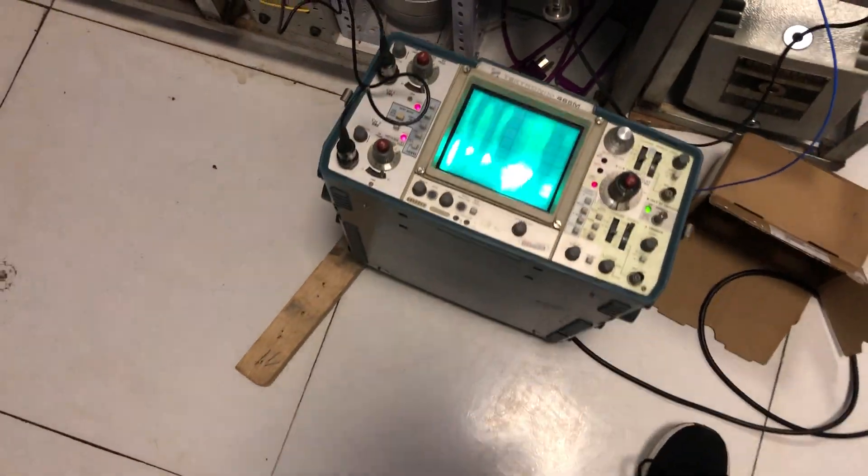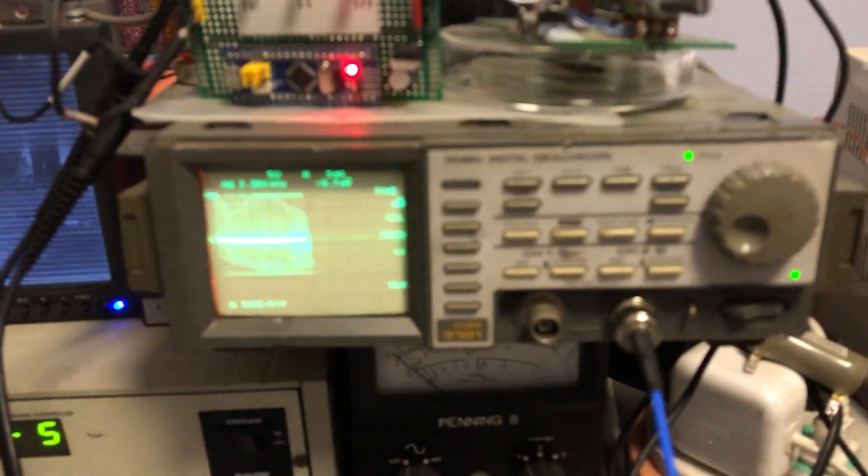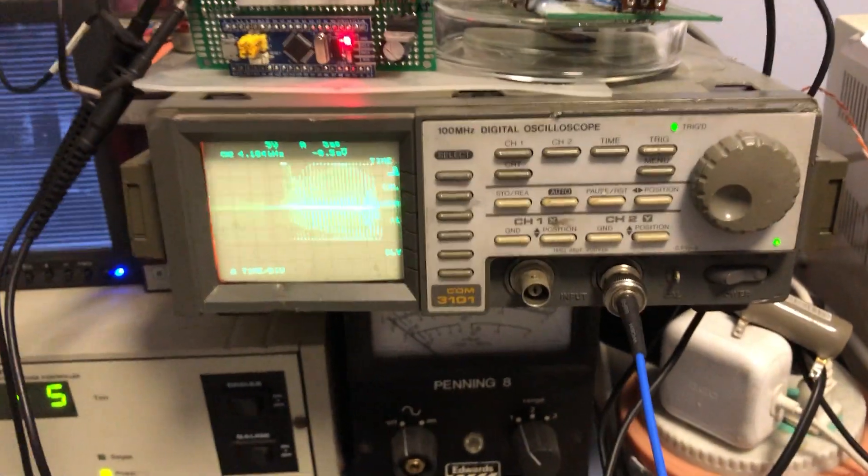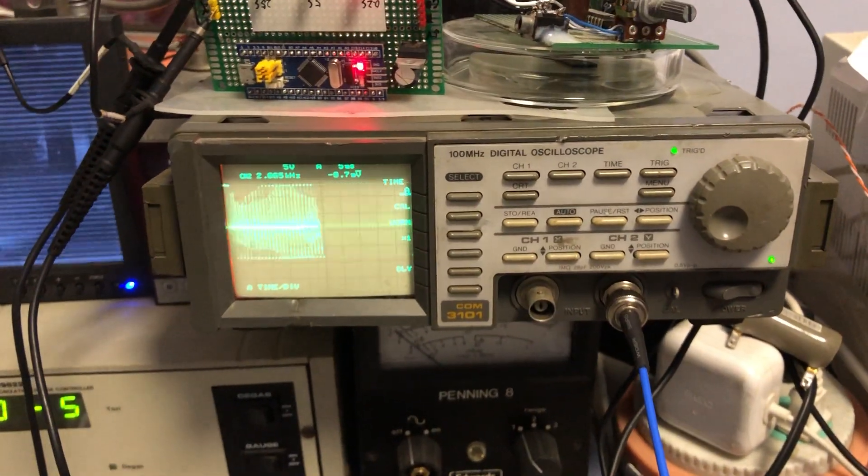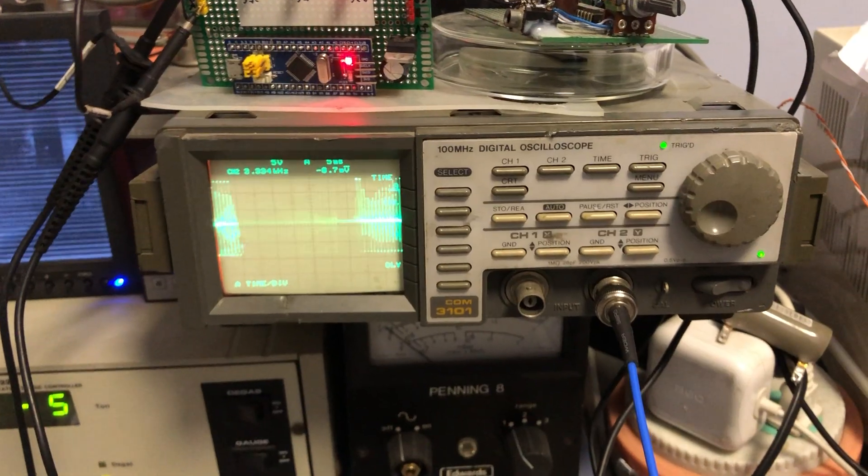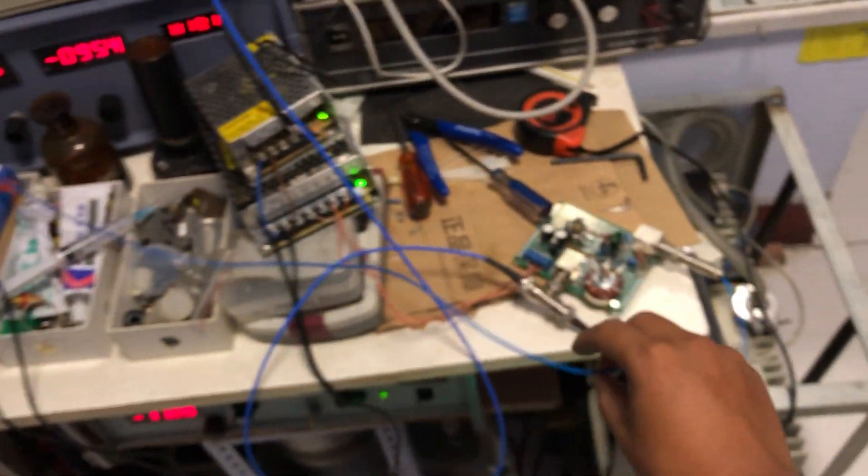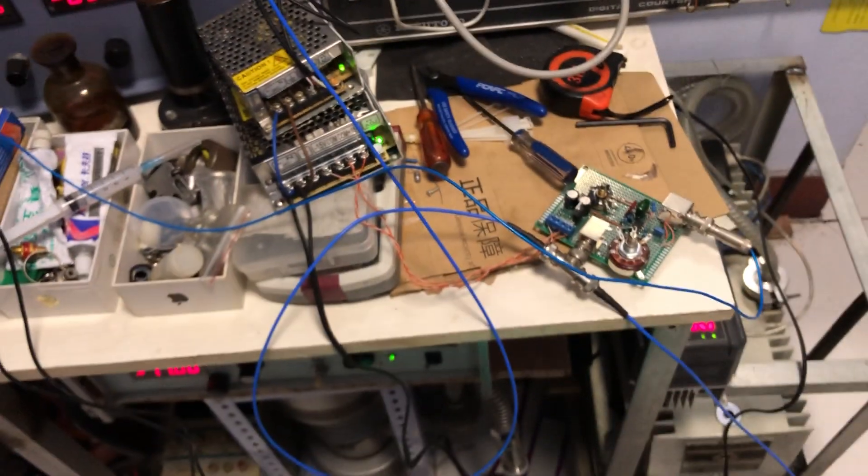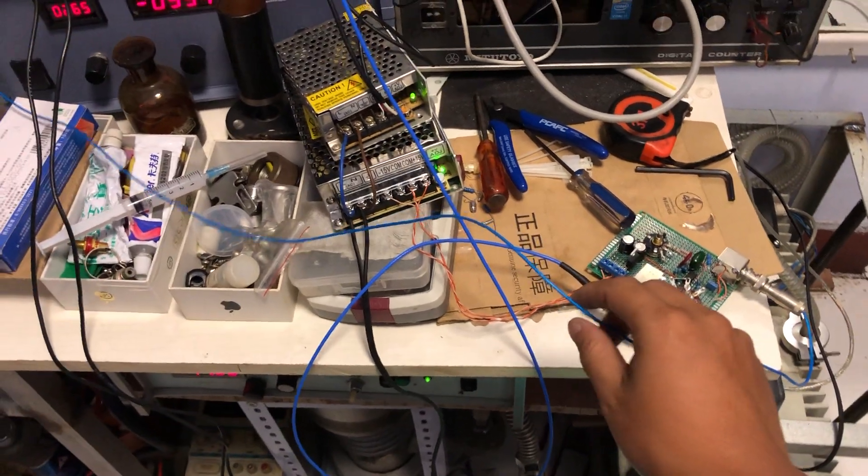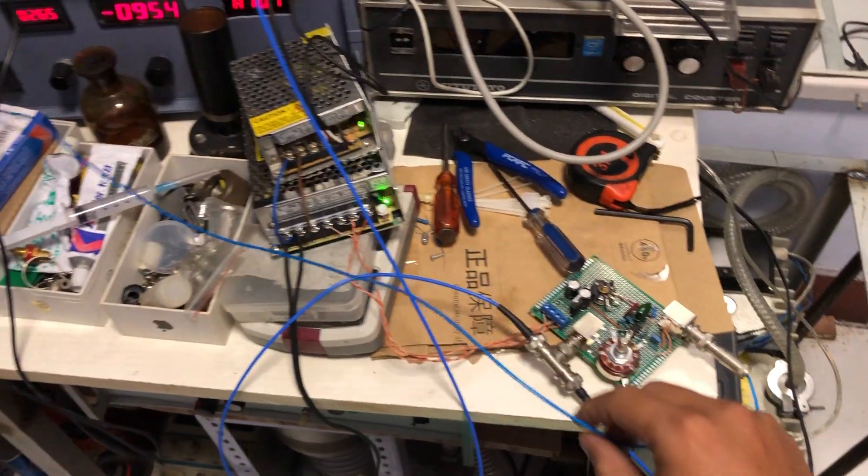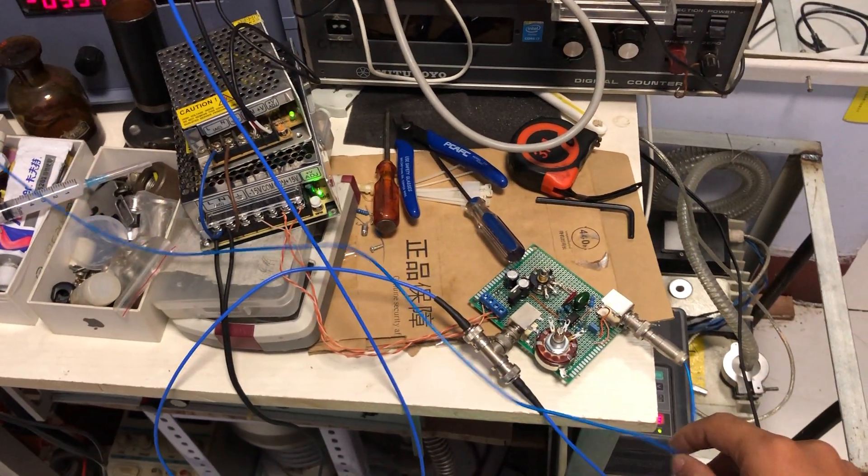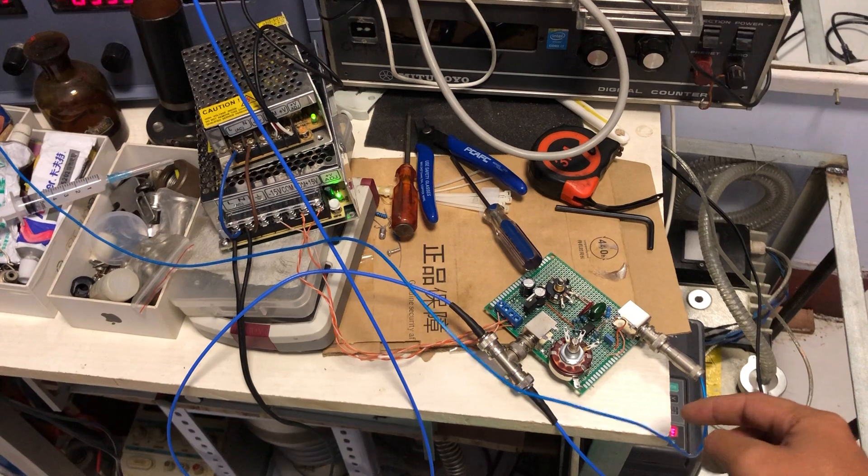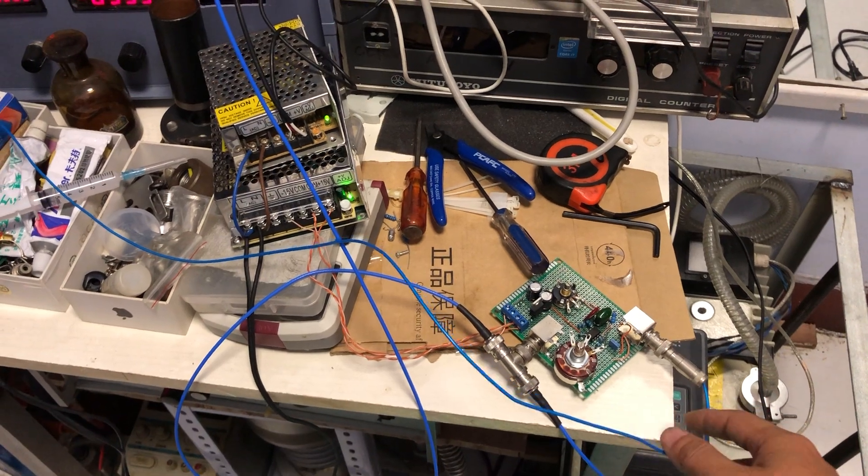So here is the signal output from the photomultiplier tube that comes through the amplifier and controls the gain and the offset.